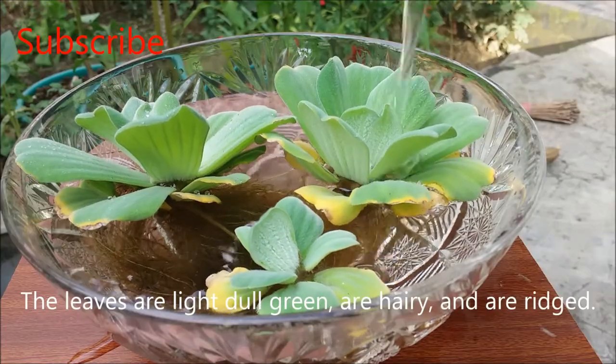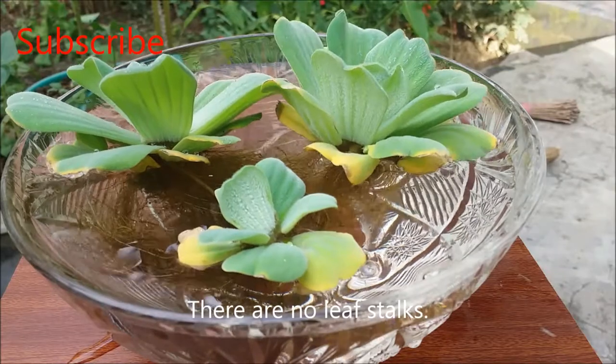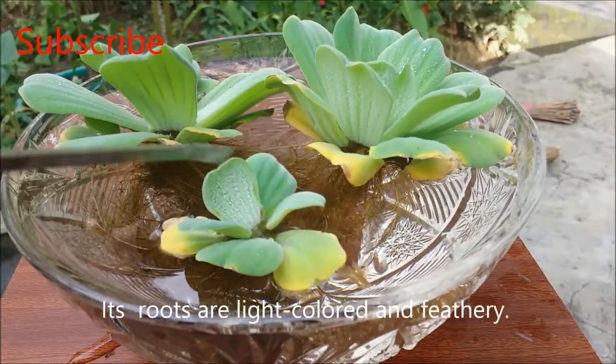The leaves are light dull green, are hairy, and ridged. There are no leaf stalks. Its roots are light-colored and feathery.